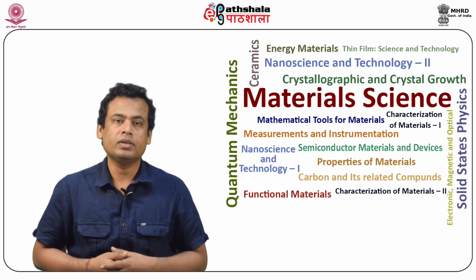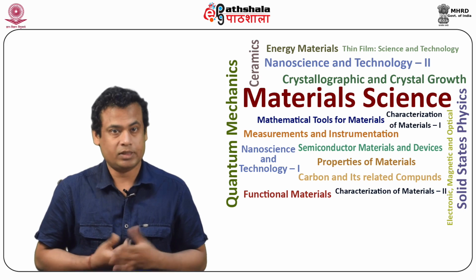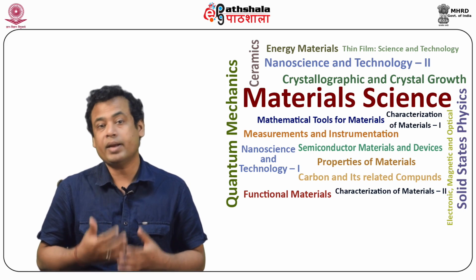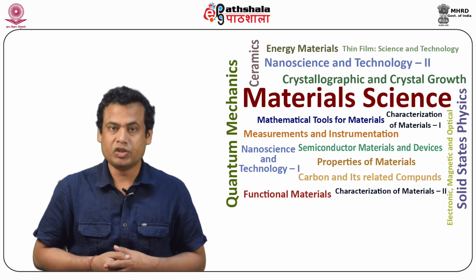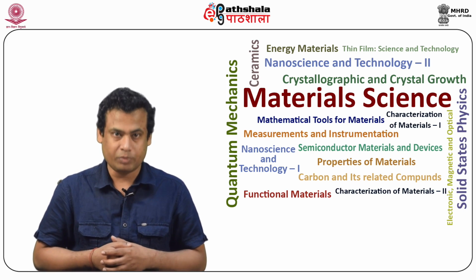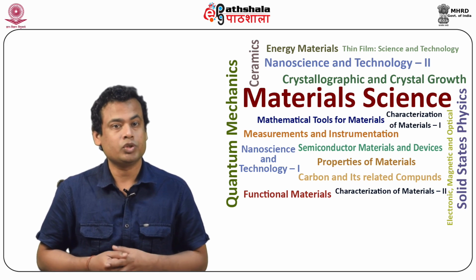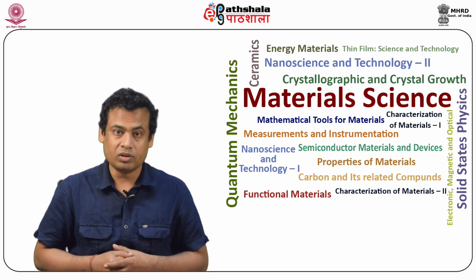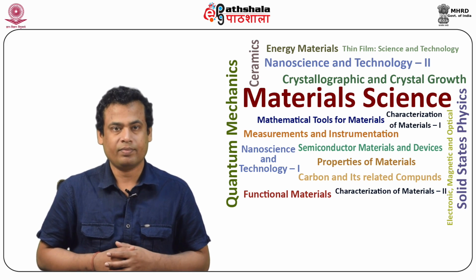First, we learned about the electrons from a source that interact with atoms in the specimen, yielding a variety of photons and electrons via elastic and inelastic scattering processes. These are the signals that we use to make images and measure to characterize the composition of our specimens.